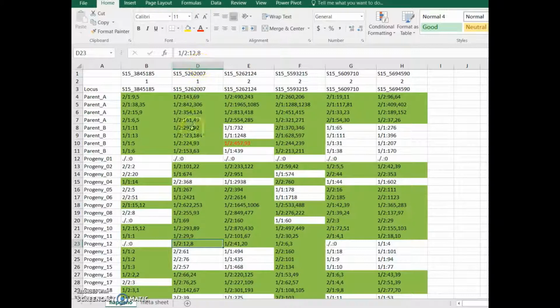I made a slight change in one of the markers here, because there was a slight problem. Now, once I have color coded the desirable alleles, you can see the patterns emerging. Parent A appears to have the entire haplotype region for the trait you are interested in, so I can tell this parent A is positive, carrying that haplotype.